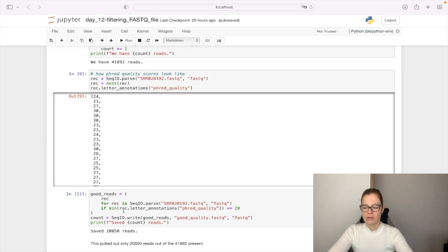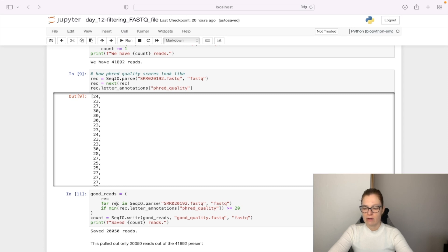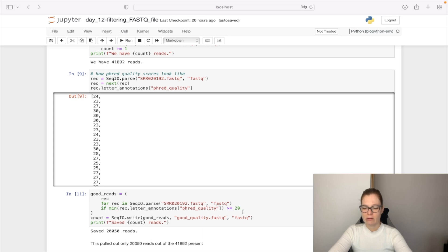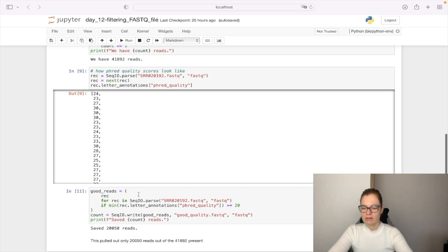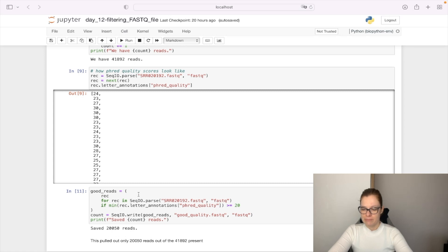We parse our FASTQ file, and for each sequence record we check if the minimum of our Phred quality scores is greater than or equal to 20, and we save this in a good_reads variable.